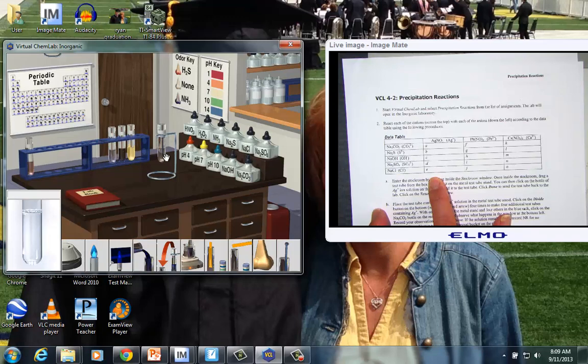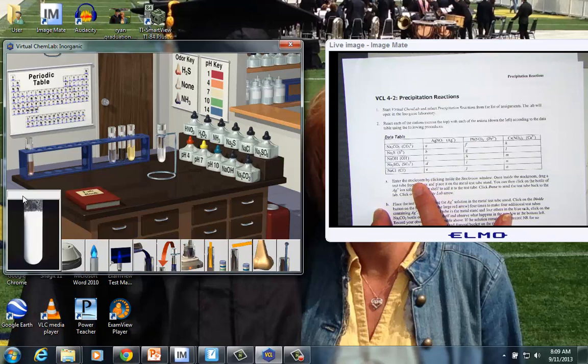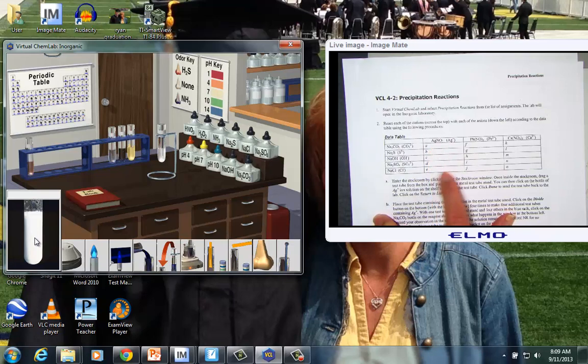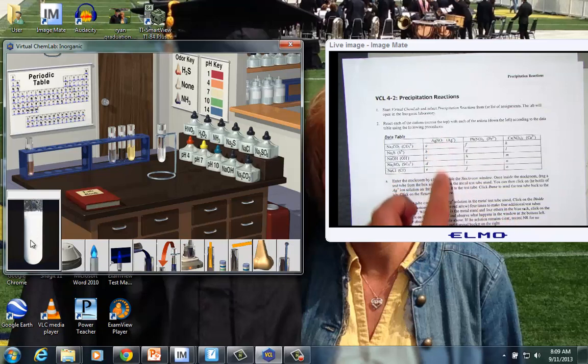We have one more, and that's to add the sodium chloride. White solid formed. So NaCl with silver nitrate does, indeed, form a white solid precipitate. So I've done the silver ions for you.